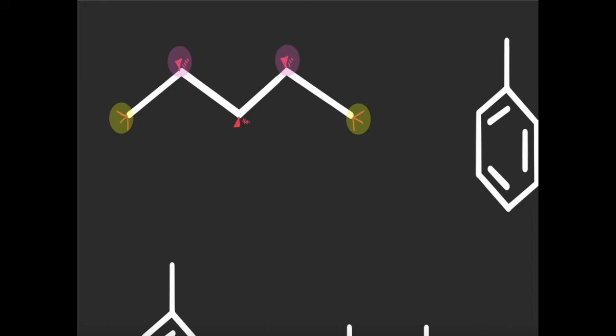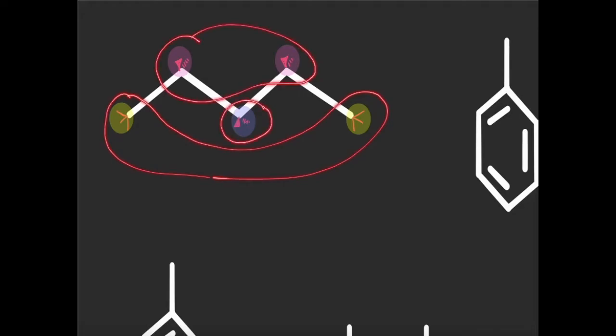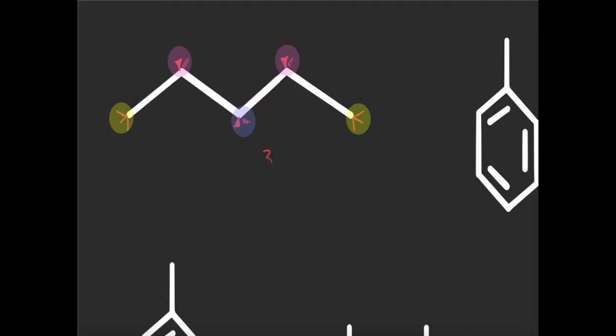It's unique, therefore that's the third signal. So for this molecule, we're going to have a total of 1, 2, 3 signals. So 3 H-NMR signals for this one.